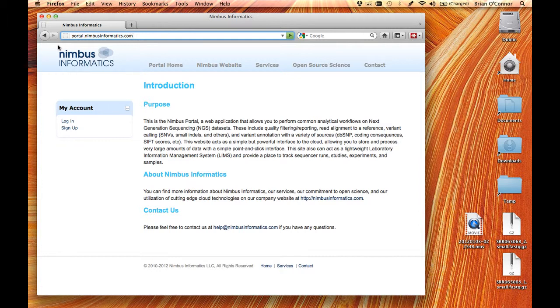So in this tutorial, I'm going to show you how to log into the Nimbus portal and give you basic information about how to set up studies, samples, experiments in preparation for uploading data and analyzing data on the cloud. In subsequent videos, I'll show you how to actually do the ingestion of sequence data into the cloud and also how to trigger workflows and get analysis results back.